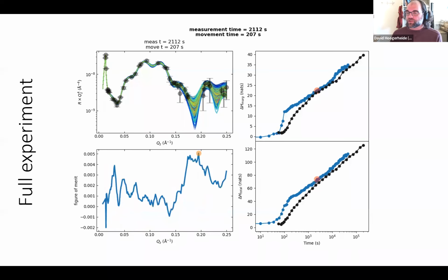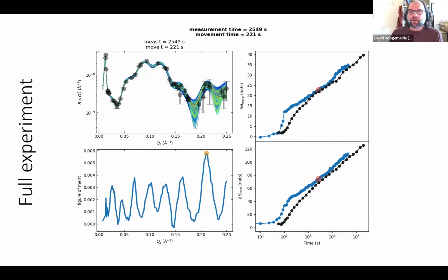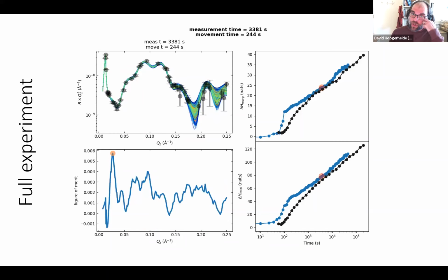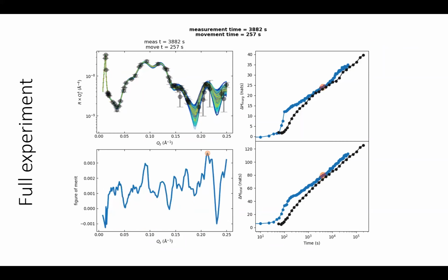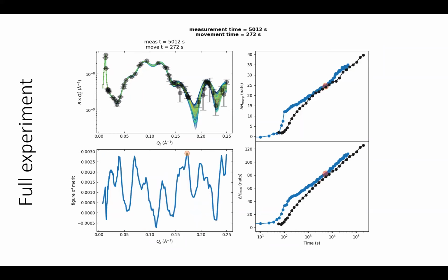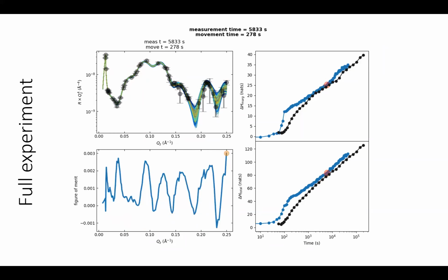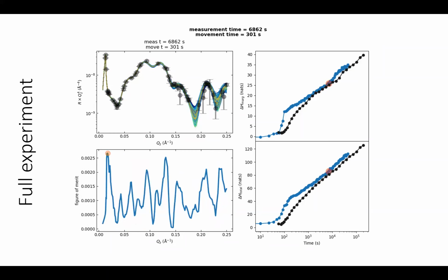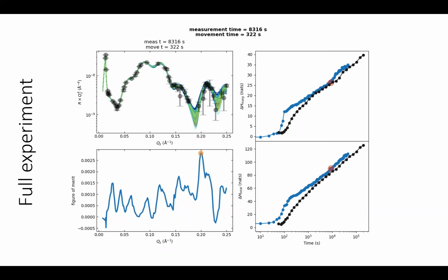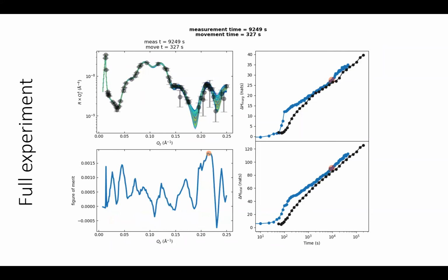The total thickness is a good parameter, but the individual leaflet thicknesses, you have to measure for a long time to really constrain those. So what is the gain in information? You're showing us the reflectivity, but you don't show us the electron density. How much information do I gain if I do that? And is it worth it? I mean, you always, right. It's always a balance of how much time you're going to dedicate to something for the reward of it.